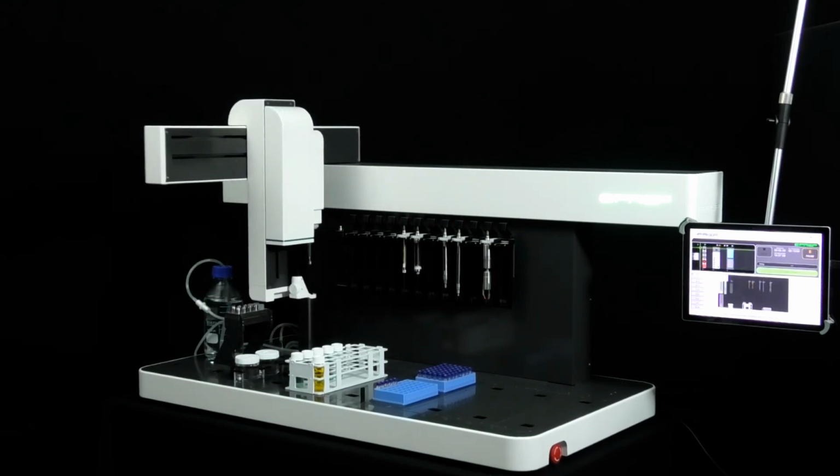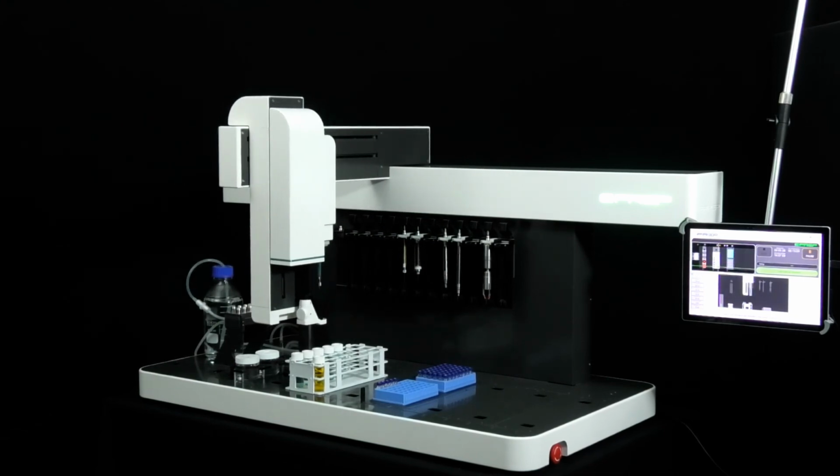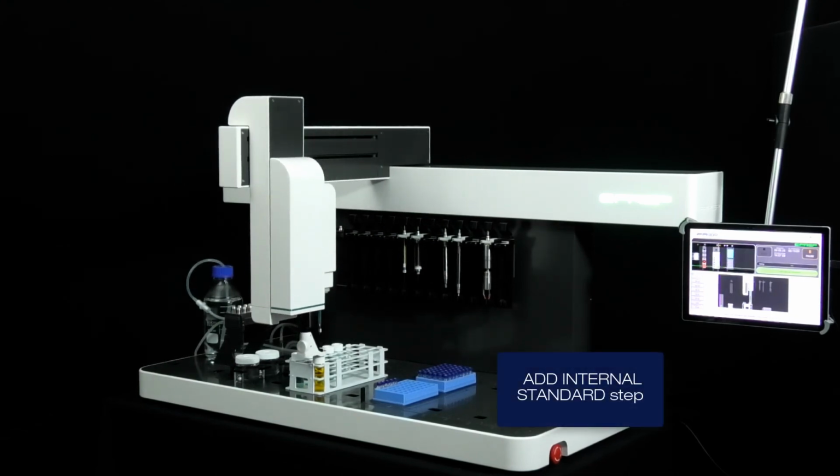The next part of the workflow review is the 100 microliter syringe has already been taken and 75 microliters of internal standard solution is aspirated and dispensed into the first autosampler vial.